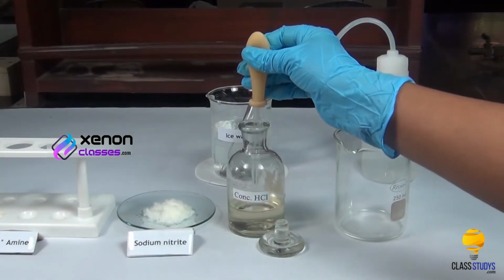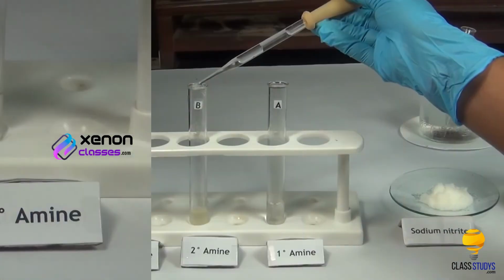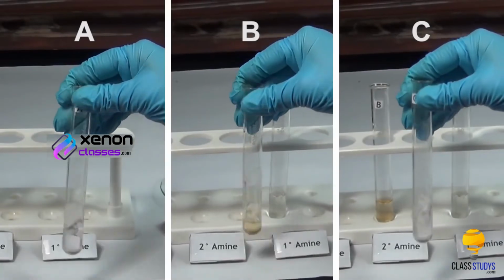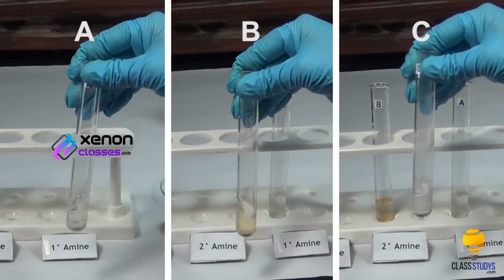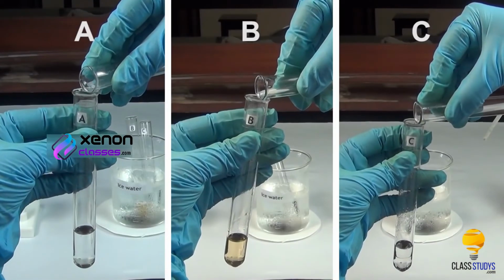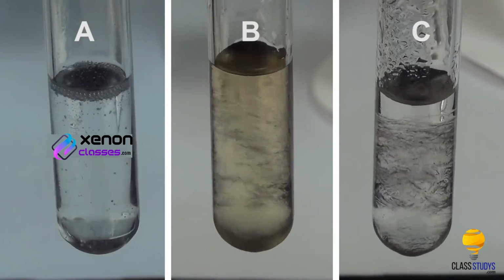Now, using a dropper, add a small quantity of concentrated hydrochloric acid to test tubes A, B and C. Shake the test tubes well to dissolve the compounds in concentrated hydrochloric acid. Cool the test tubes in ice-cold water for some time. Now, add sodium nitrite solution to test tubes A, B and C.